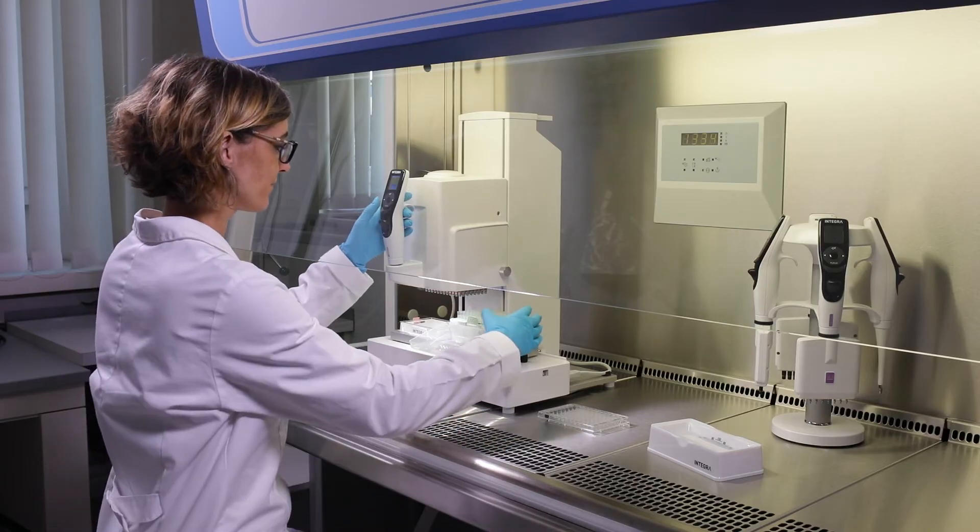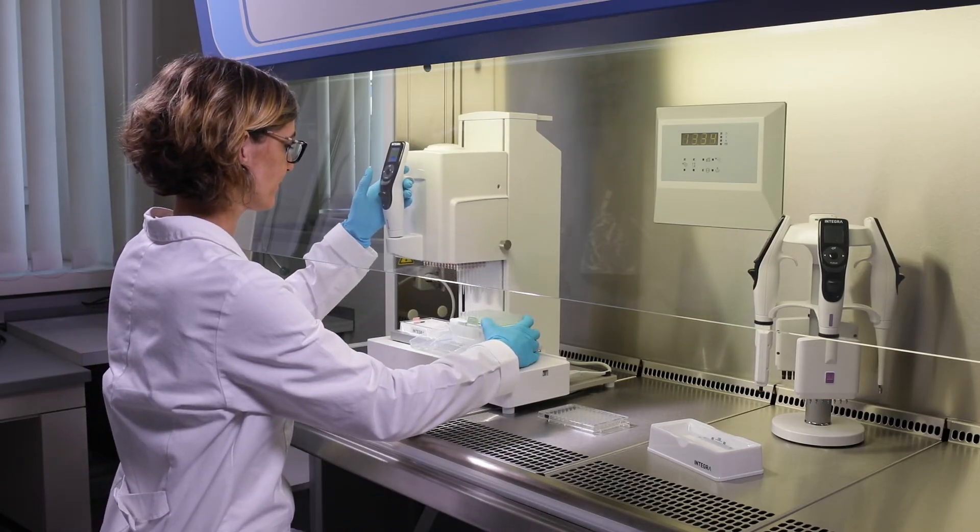Even serial dilutions can also be performed, by simply partially loading the tips.